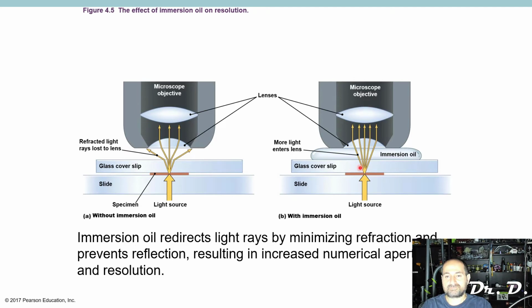Does that make sense? Now, if I switched it to dark field microscopy, the light would hit the specimen, and then the light would just leave. The light would not get captured into the microscope. So the light coming in would just leave, and so you would see black. But guess what? If light were to hit the actual specimen that you want to study, the light would get refracted or bent inwards so that it would be captured by the objective lens and viewed under the specimen.